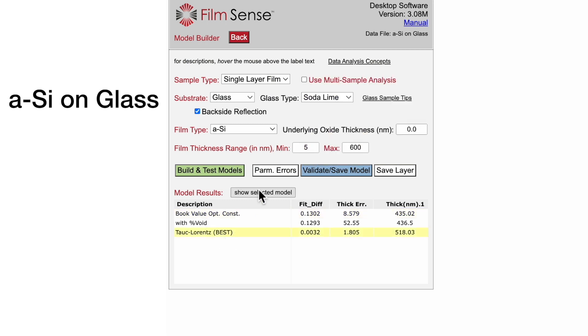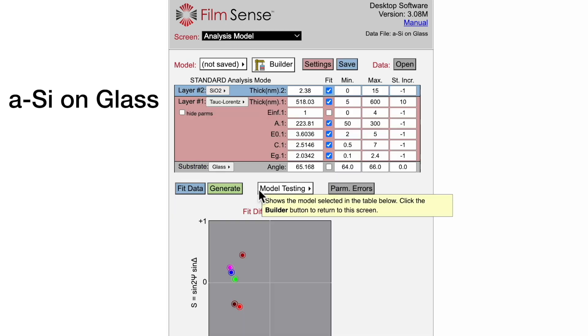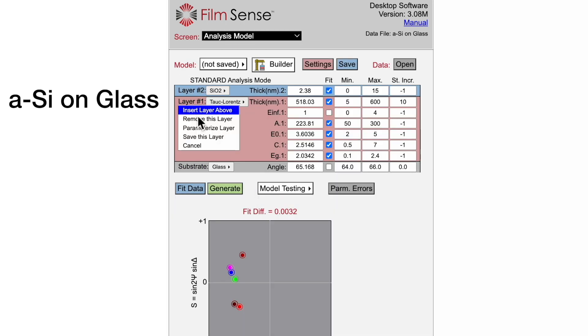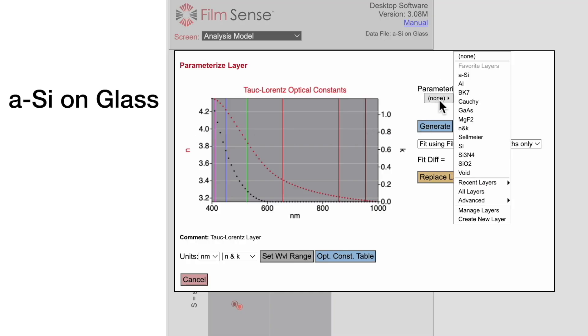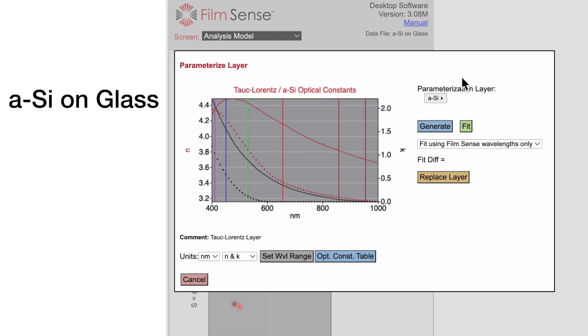We can plot the optical constants of the Tauc-Lorenz layer and compare them with book value amorphous silicon. The general shape of the N and K curves are similar, but significant offsets are observed. This is due to differences in the film deposition method and process parameters, and such variations are very common for thin film applications.